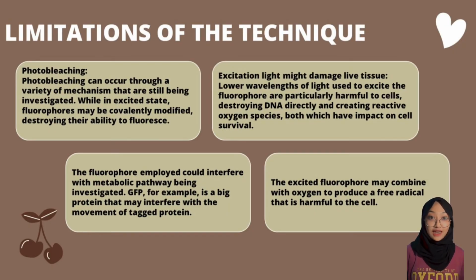The last slide, limitations of the technique. First, photobleaching can occur through a variety of mechanisms that are still being investigated. While in the excited state, fluorophores may be covalently modified, destroying their ability to fluoresce.